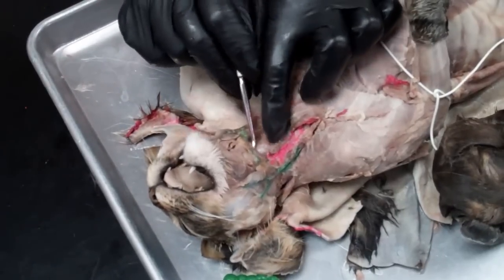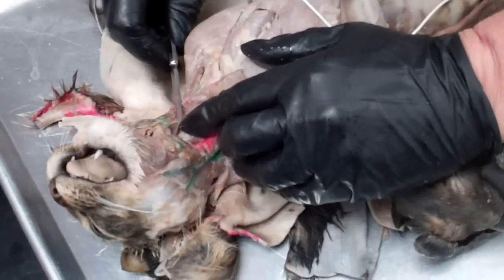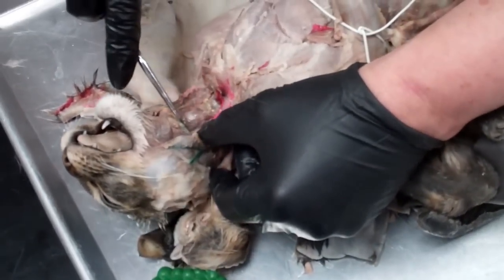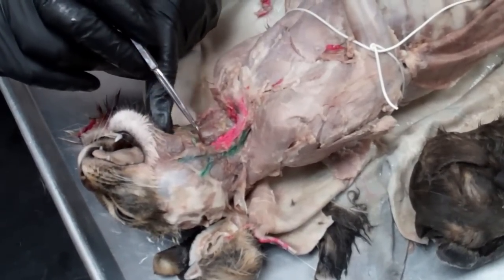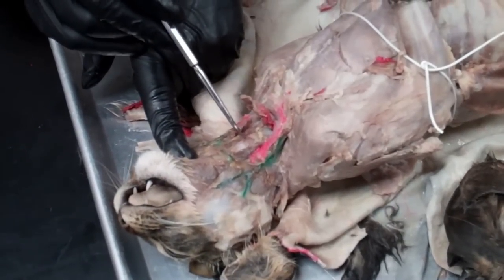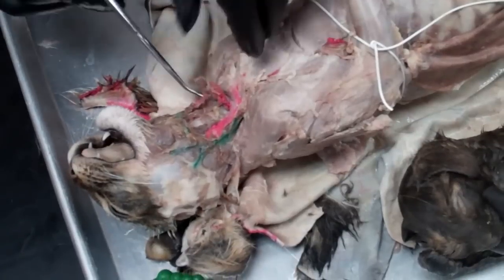The thyroid gland is on either side here. We're also going to want to find the epiglottis, which is right underneath the transverse jugular. On the side, this dark area right here is the thyroid gland, and there should be one on both sides. This dark area that goes across here is the isthmus of the thyroid, and then there should be another thyroid on this side.